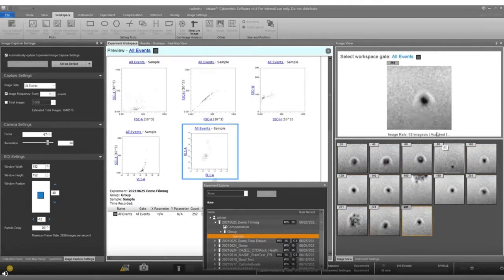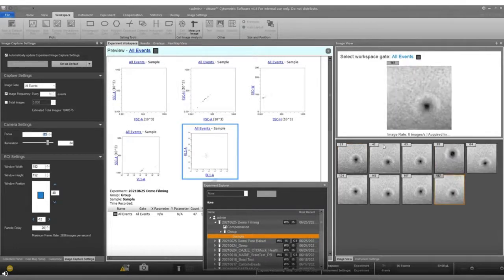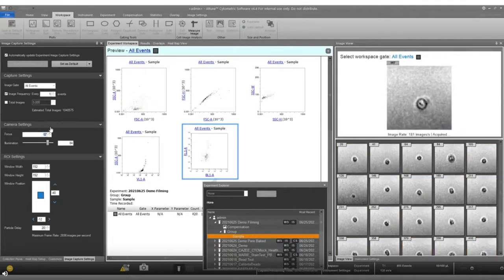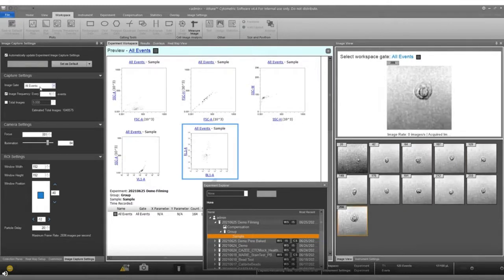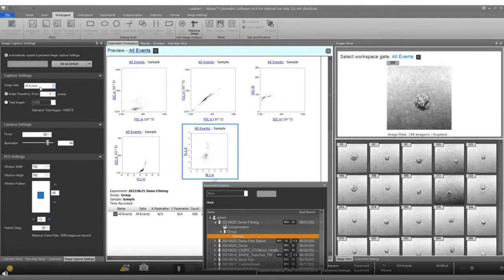So as you saw with the last images, we are quite out of focus here. So I'm going to play in increments of 10 with our focus to see if it gets better or worse. I think we can all agree that that is worse. Go for 57. Okay, much closer. And if your sample rate is fast enough, you can usually see some preview, so you can see those are actually getting a little more out of focus. So I'm going to continue further into this focal plane. And if you weren't saying wow before, I know you're saying wow now. This was just during the very first training session, my jaw dropped.